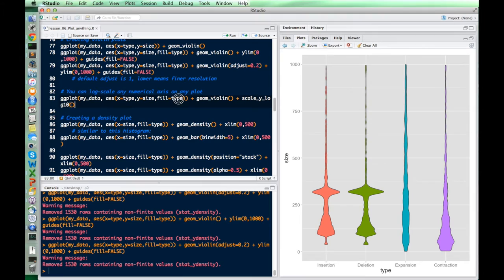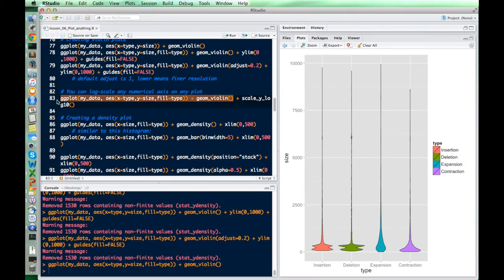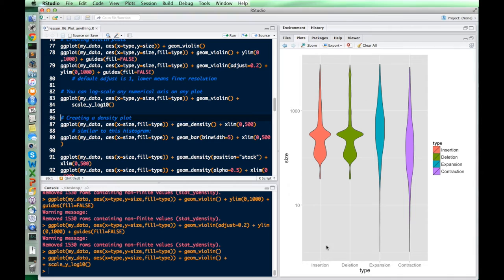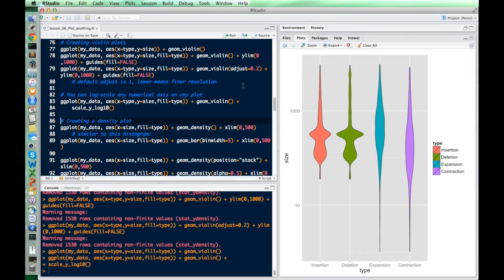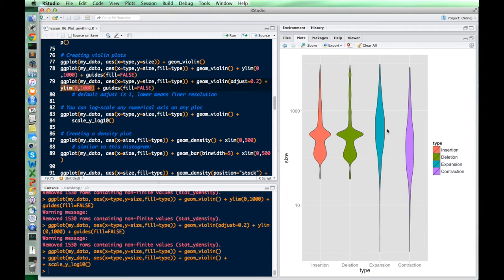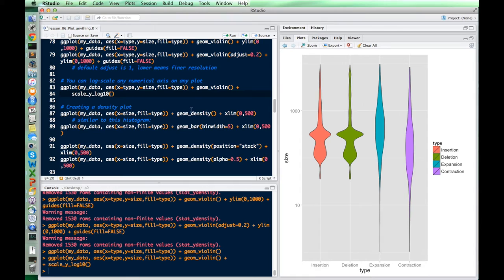Another useful thing is making any numerical axis a log scale. We add scale_y_log10 to the violin plot, and now the y-axis goes from 10 to 1000 on a log scale, spreading things out much more. This is an alternative to zooming in — instead of cutting off large values, you compress them using the log scale. You can do this to any numerical axis on any plot.